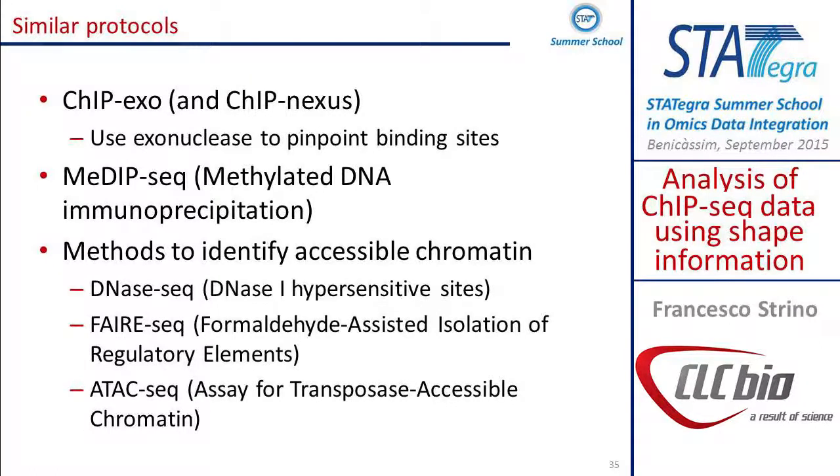And now I'll talk a little bit about similar protocols, because very often people will use ChIP-seq algorithms for some of those, and it's not necessarily a bad idea in most cases. So I'll just describe a little bit some of the protocols that you can use it for.